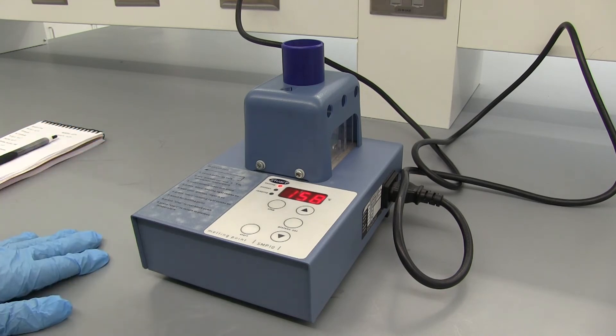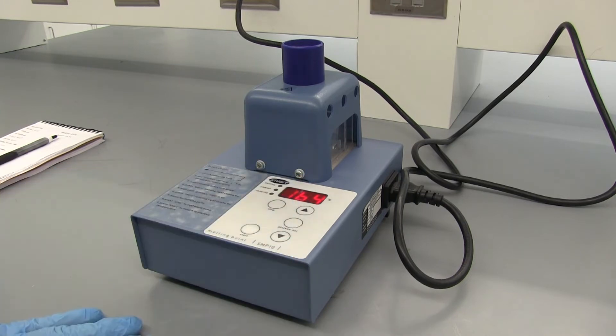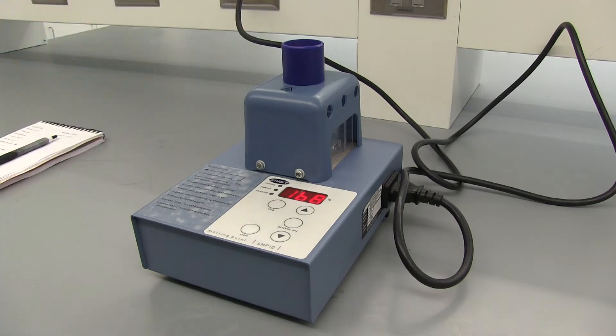And so now we're going to do a slow melting point starting a bit below 126 degrees Celsius and we'll ramp it slowly once we get to that point. So to stop it go ahead and press stop and it'll begin cooling down the block and we're going to go and make up another sample to do our slow melting point.